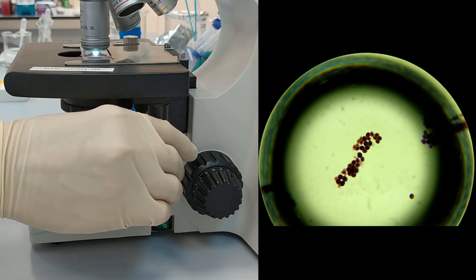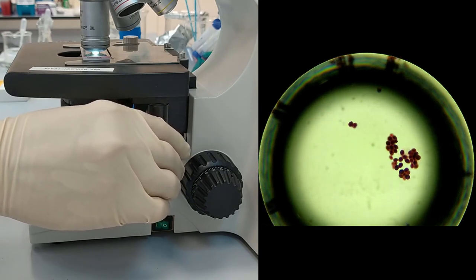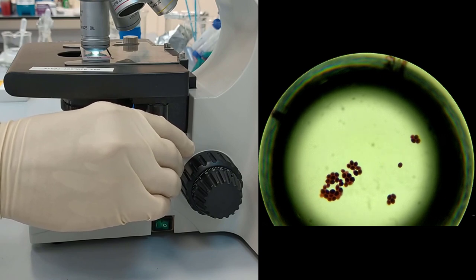As you can see, they both retained violet and pink staining.